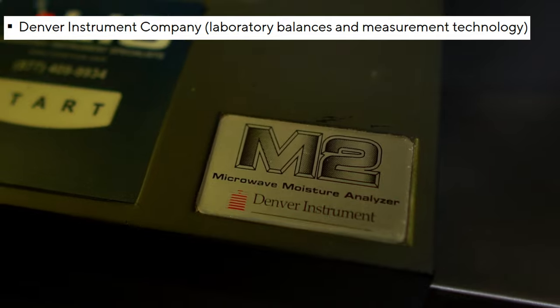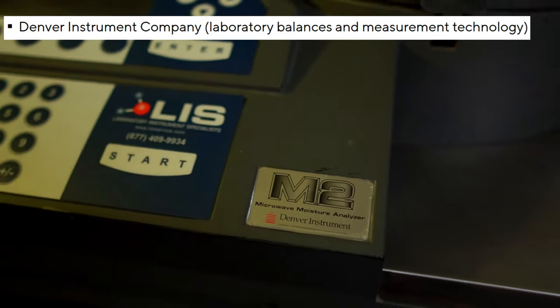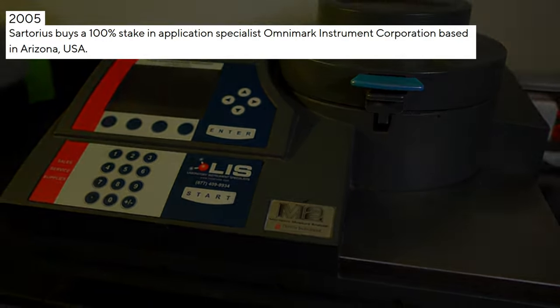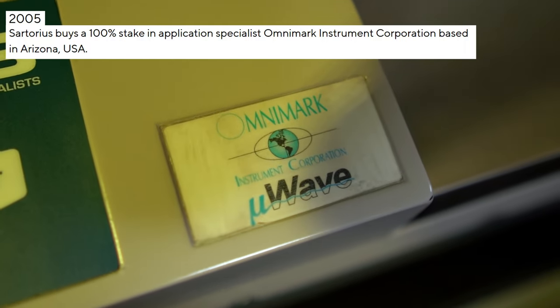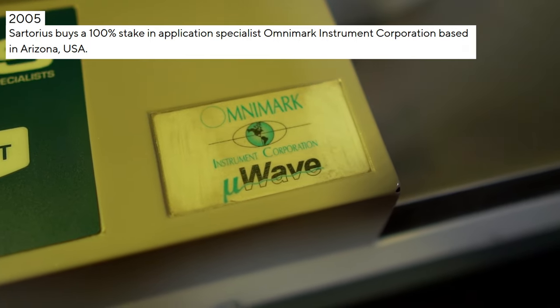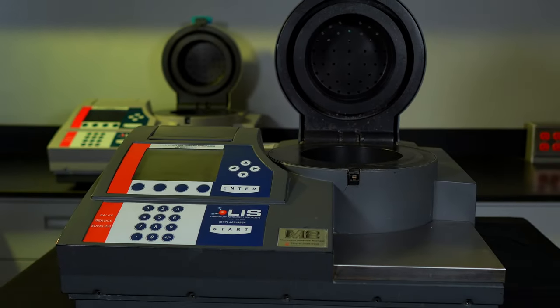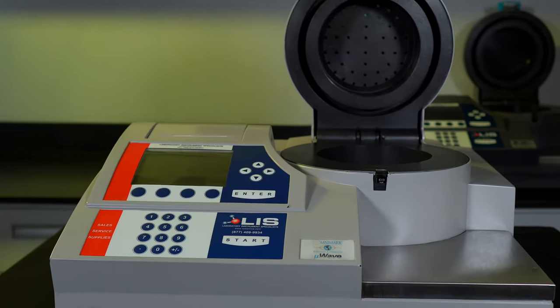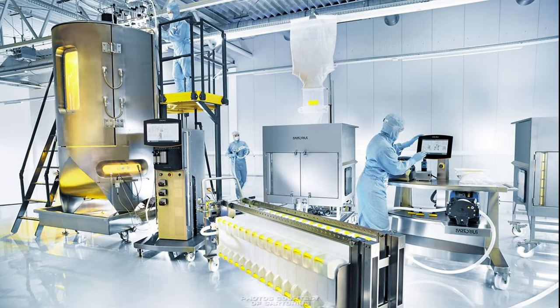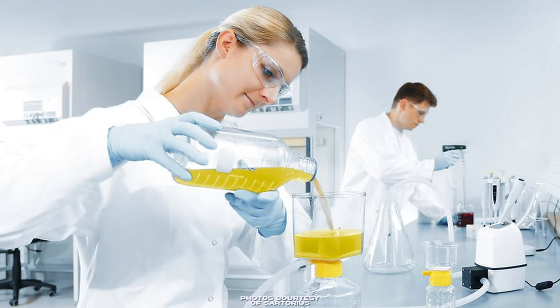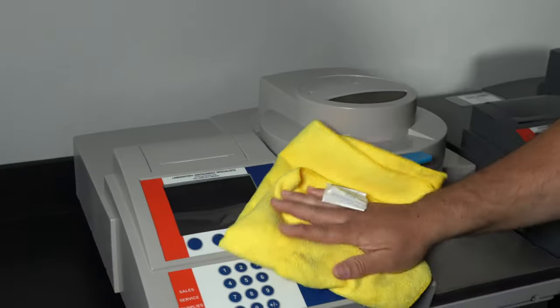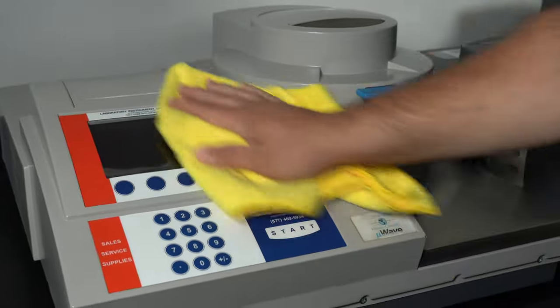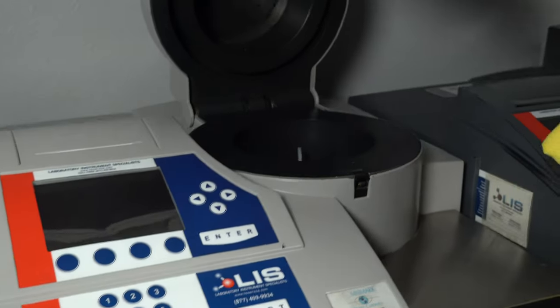In 1999, they acquired Denver Instrument Company to expand into the lab balance and measurement tech industry. In 2005, Sotorius bought a 100% stake in OmniMark Instrument Corporation. Those two company names may sound familiar, right? Well, that's because we mentioned them in the very beginning of this video. Today, they produce equipment ranging from microbiology to pharmaceuticals to water purification and laboratory equipment. That's where LIS comes into play. We service and sell these products even though they're a couple decades old.